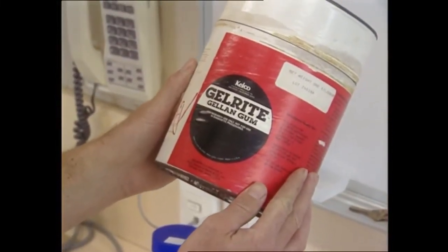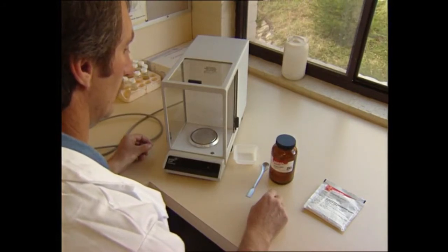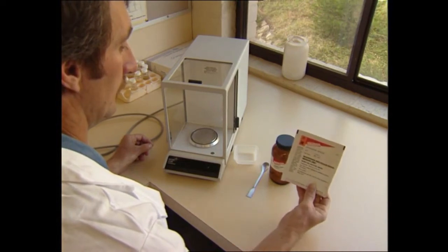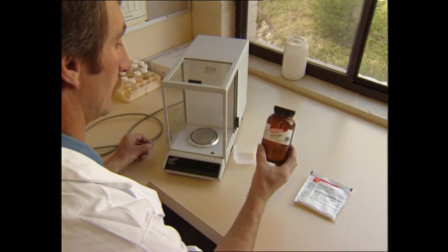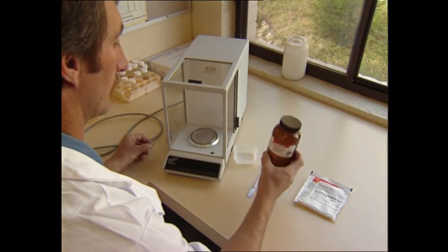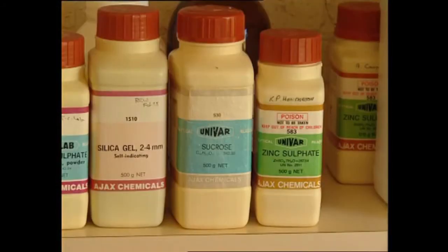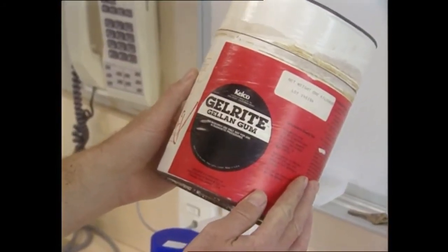To prepare a batch of medium, we can either use pre-mixed media such as Murashige and Skoog, Gamborg, White, etc., which can be purchased from chemical companies such as Sigma, which has a wide range of media in powdered form. The only thing we need to add to this mixture will be sugar, plant hormones, and the gelling agents where necessary.